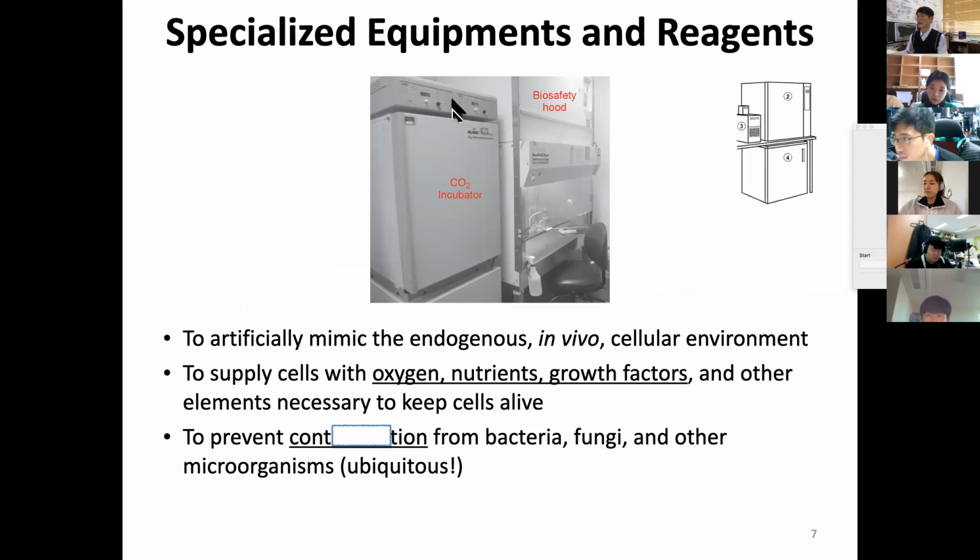So here is the upper one, the CO2 incubator, and I showed you part of this as a laminar hood. The laminar hood is a place where everything is supposed to be clean. The air flows from top to outside. This is the airflow direction, and that airflow has to be filtered.